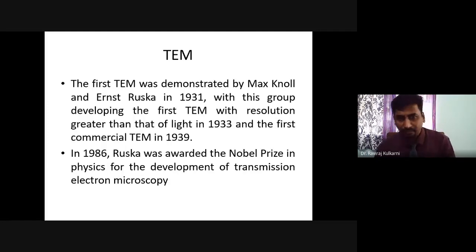This is commonly known as TEM, transmission electron microscope. It was first demonstrated by Max Knoll and Ernst Ruska in 1931, with this group developing the first TEM with a resolution greater than that of light, less than 400 nanometers.